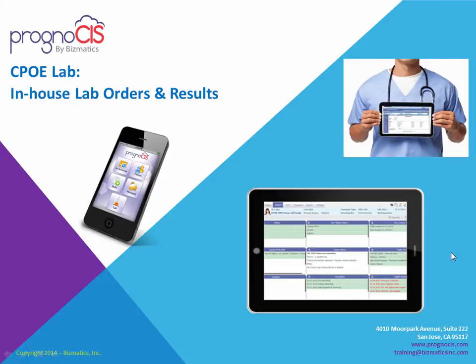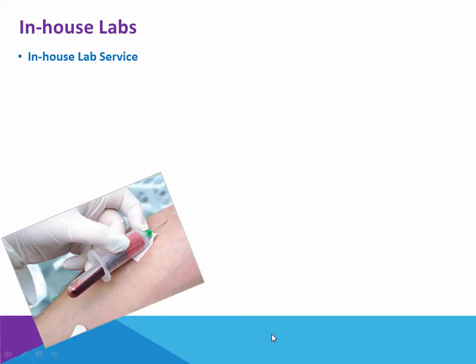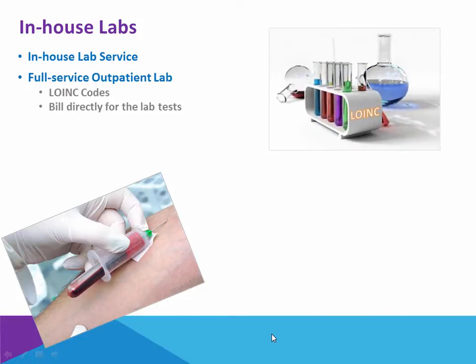CPOE Lab, in-house lab orders and results. Many of you may have an internal lab service within your practice, whether it is a full-blown outpatient lab where you're billing for everything and you have LOINC codes for your billing and all that, or you're just simply doing simple specimens in-house and then through courier sending them out.